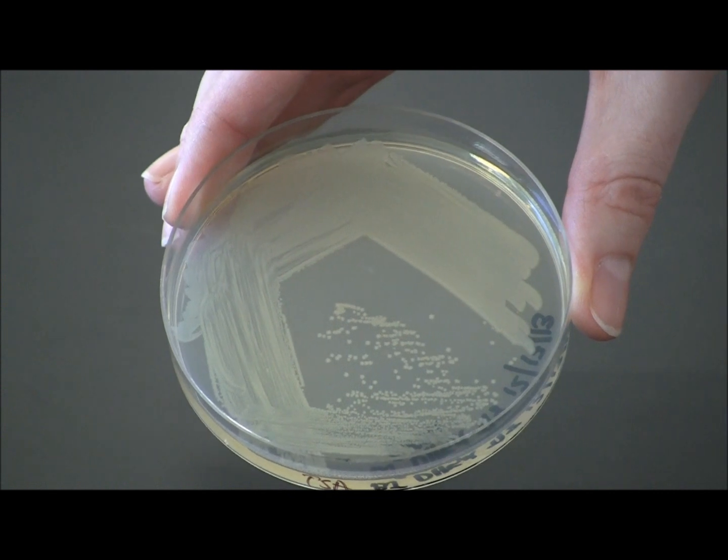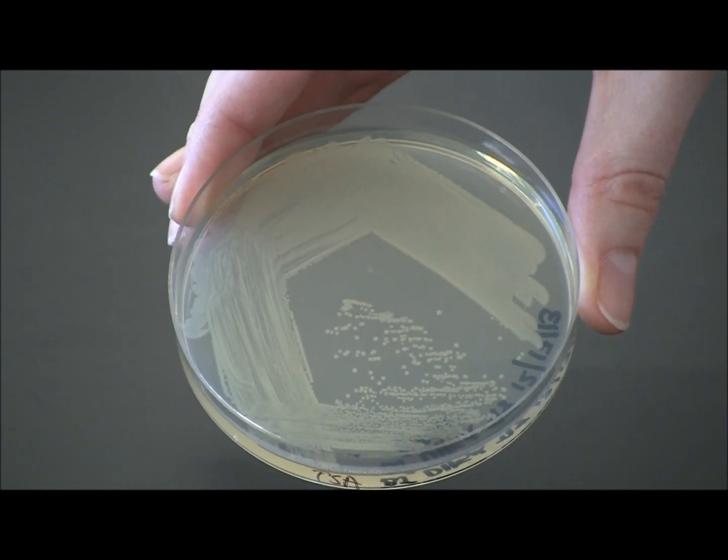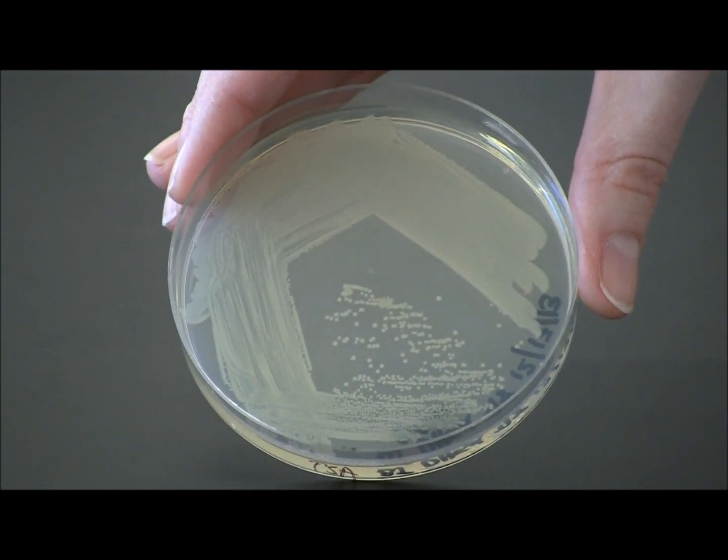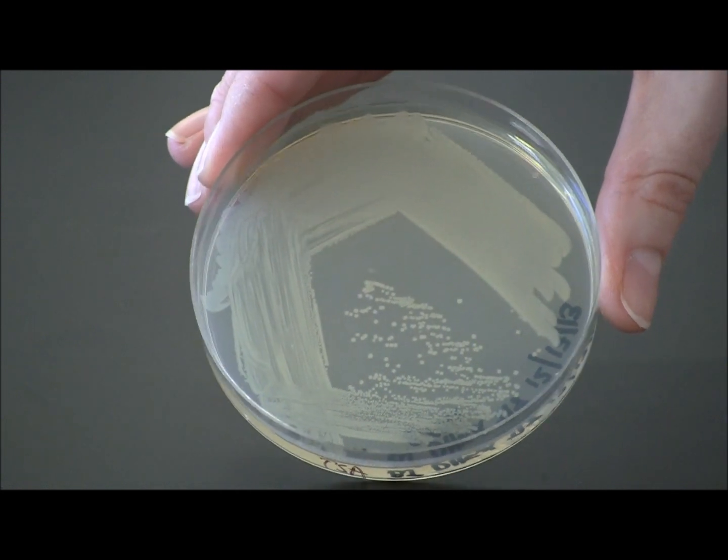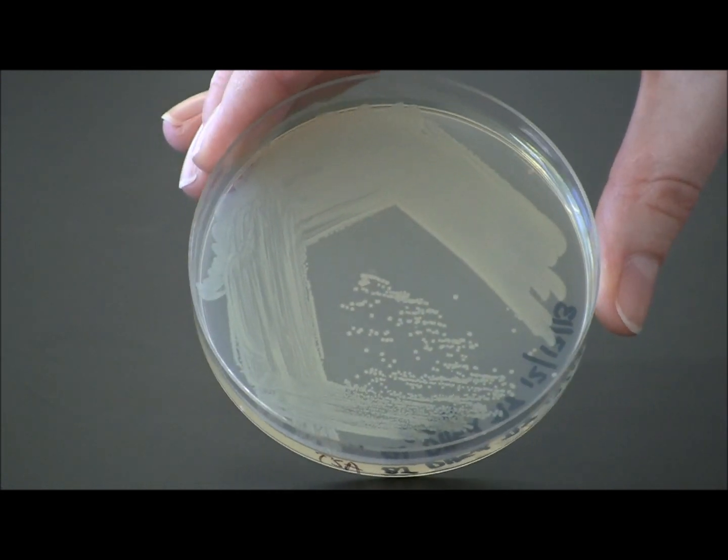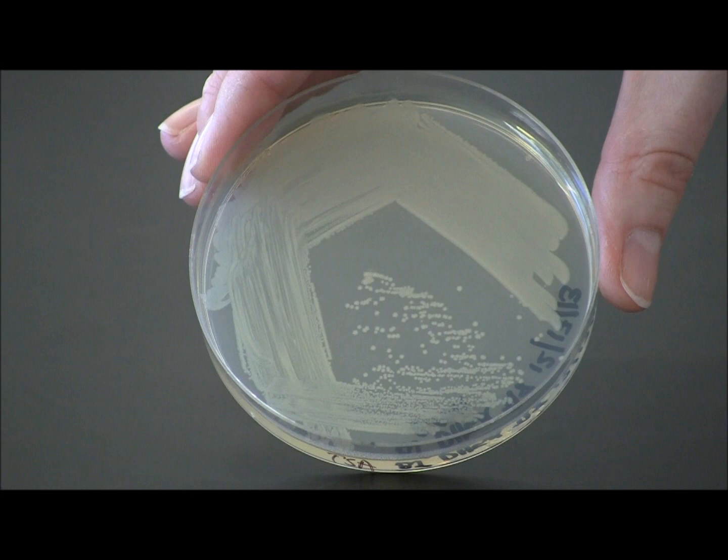This is an example of an isolated colony streak plate, which you should see after you've incubated your plate for the specific amount of time. You can see the isolated colonies in your fourth quadrant.